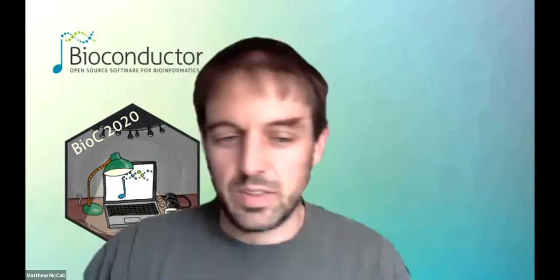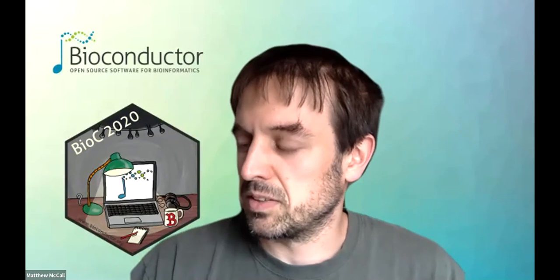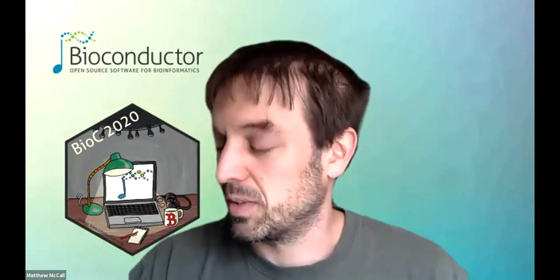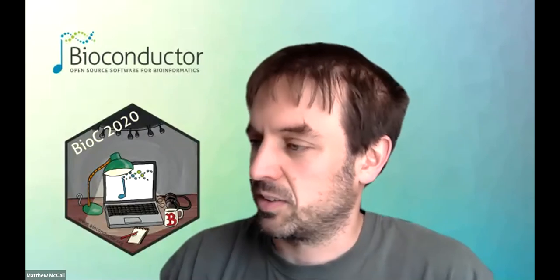When we used UMAP. All right, so the next question is for Dario. Can you see SpatialExperiment, the class, also holding morphology information, cell masks, or even images?